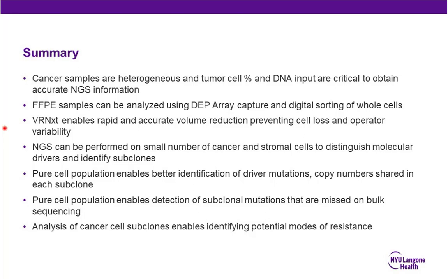It's very important to have an accurate volume to not overload your chamber, but let's say it's 10, 12 microliters that you load in. You do the cell count before, so you know how many cells you have in there, so you don't overload your chamber, and you have it in about those 12 microliters that you load in.